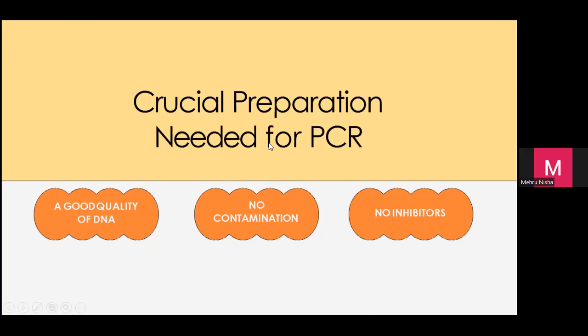So, you kena start dari the stepping stone should be a very good stone. That means the initial technique must be very good. Start DNA extraction kamu mesti bagus. A good quality of DNA. No contamination. Bila nak buat PCR, mesti buat di bilik PCR. Tak boleh buat dekat sebelahan dengan animal house. Atau berdekatan dengan tempat kamu extract stool.